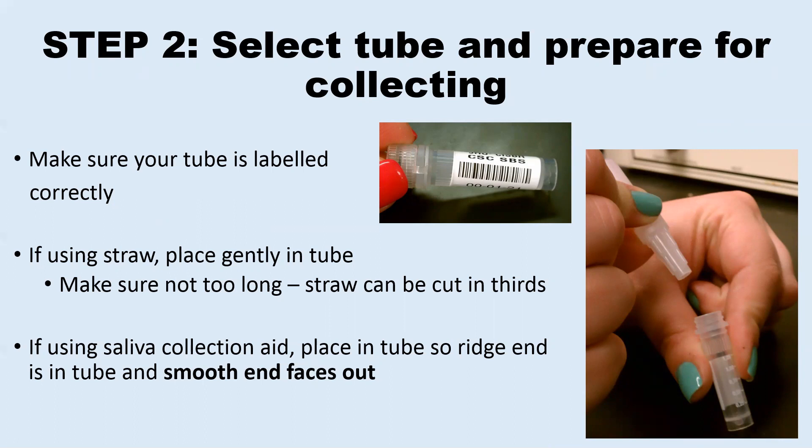Next, you will remove only the cap of the tube and place it on a clean countertop. You can unwrap your straw or saliva collection aid and, with clean hands, place it in the tube. If you are using a straw, you can hold on to it so one end is in the tube and one end is sticking out for you to spit or drool into. If you are using a saliva collection aid, you should place it so that the ridged end is placed firmly in the tube and the smooth end faces up.